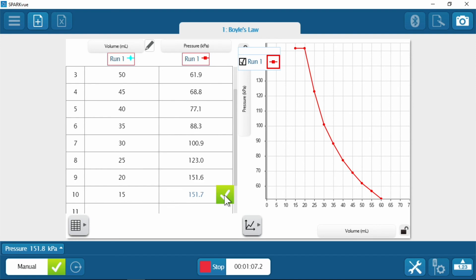We've finished one run of this experiment. You are required to do four different runs. We're going to take a break to finish off the other runs and present you with the collected data. You should be able to find the data, do your own analysis, and you'll have those four runs right next to the file your teacher provides.